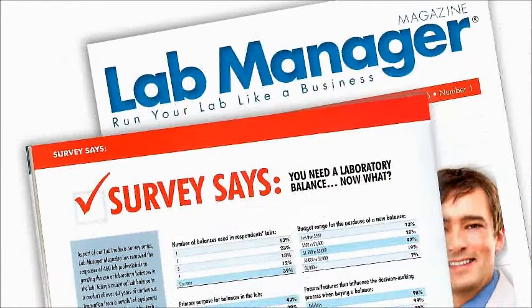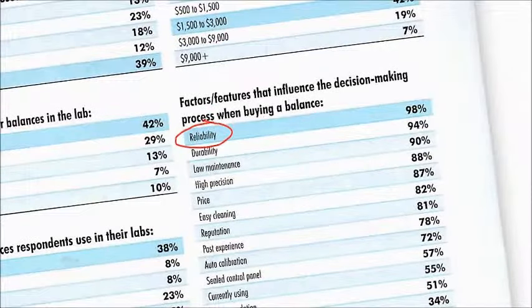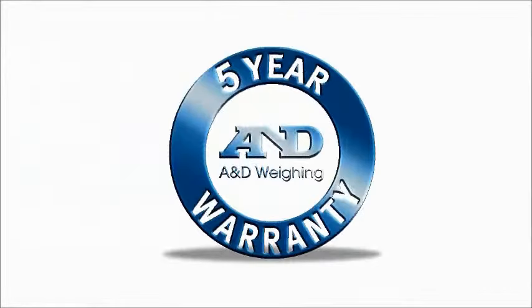In a recent lab manager survey, reliability was the number one consideration cited by 98% of respondents. So you'll be glad to learn that A&D backs the HRA with the longest warranty in the industry — five years.